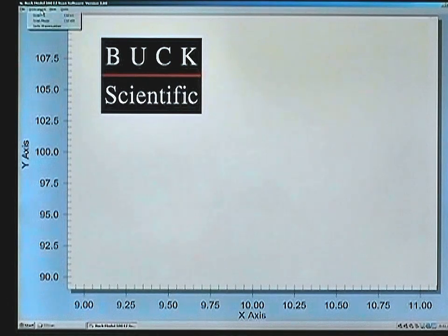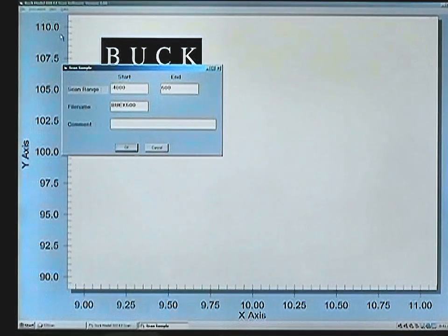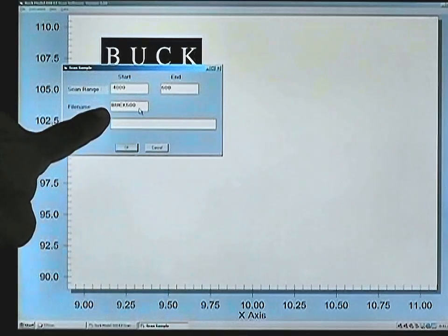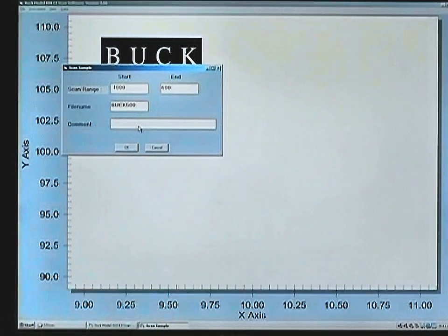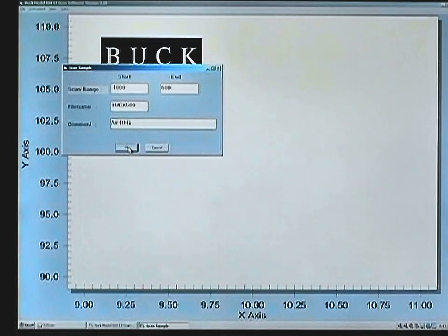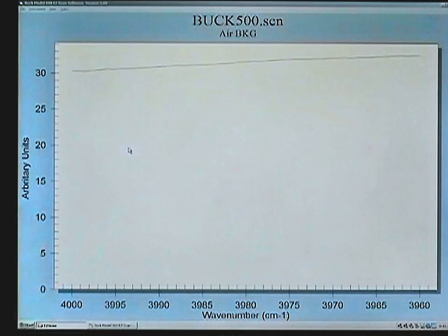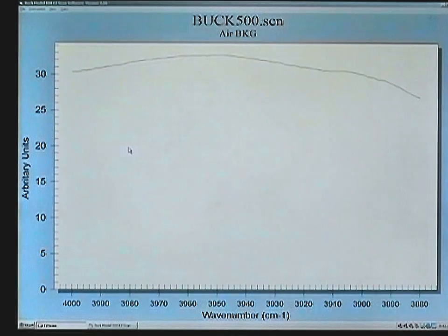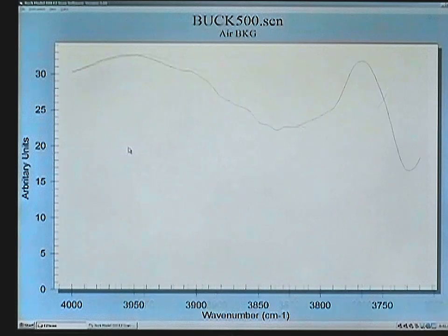We can now go to Instrument, Scan, and the software shows you the setup screen for the first scan. You can use the default file name of Buc.500, or change it to whatever 8-character file name you want. It is recommended to put a reference name in the comment screen — here we are just calling this the air background. We click OK. The system will initialize itself and begin to collect the single beam data of the air background. When this is finished, we will run a polystyrene card and show how to create the percent transmission spectrum of that sample.